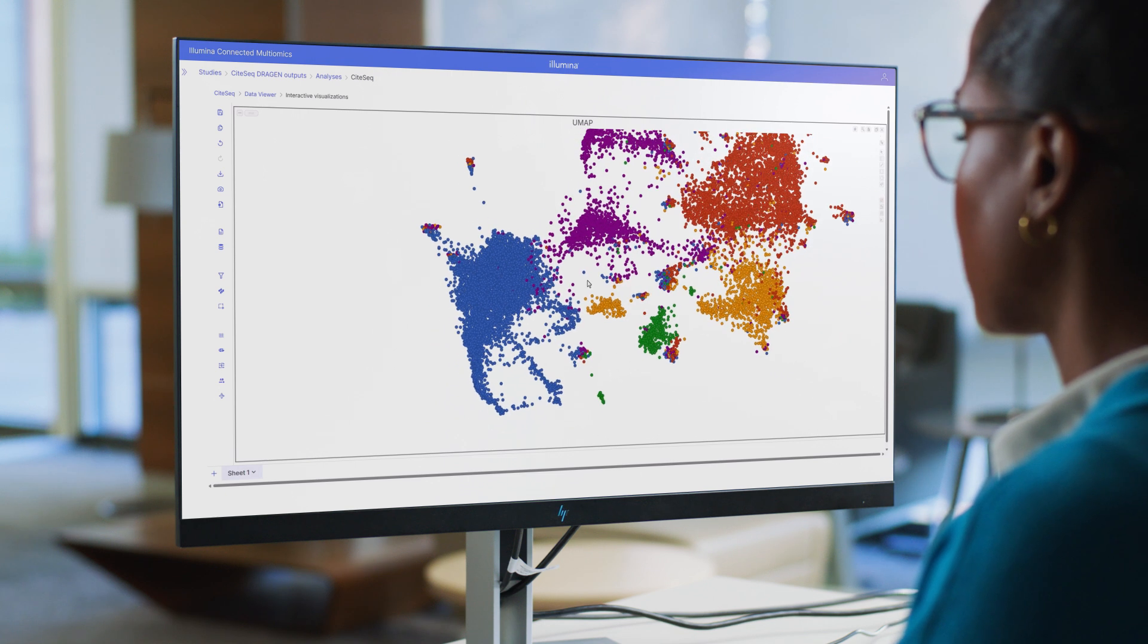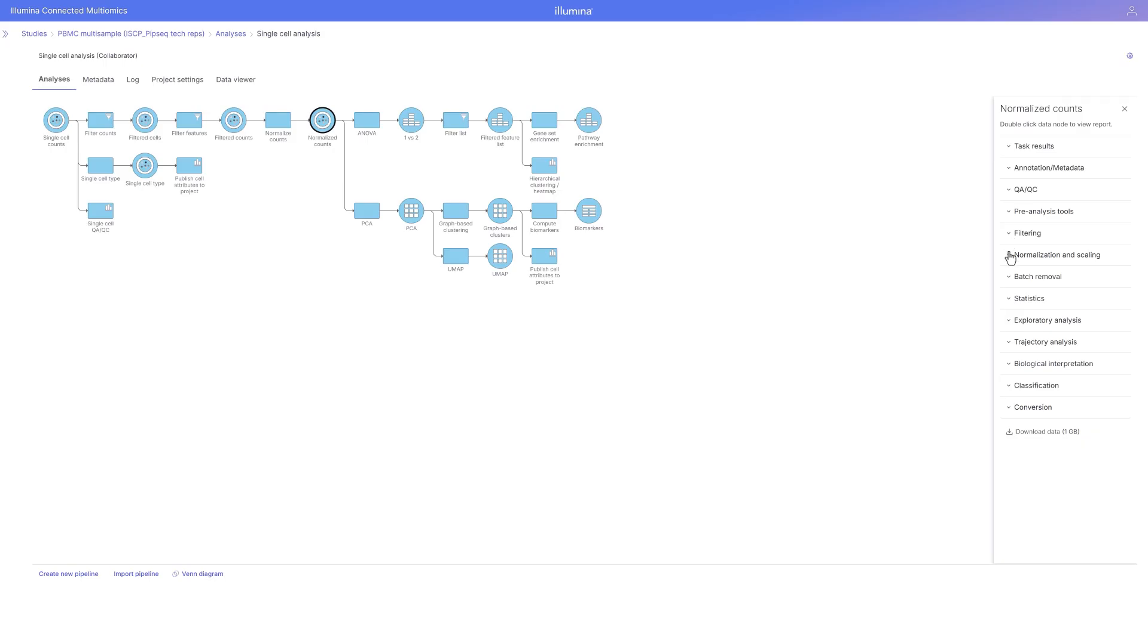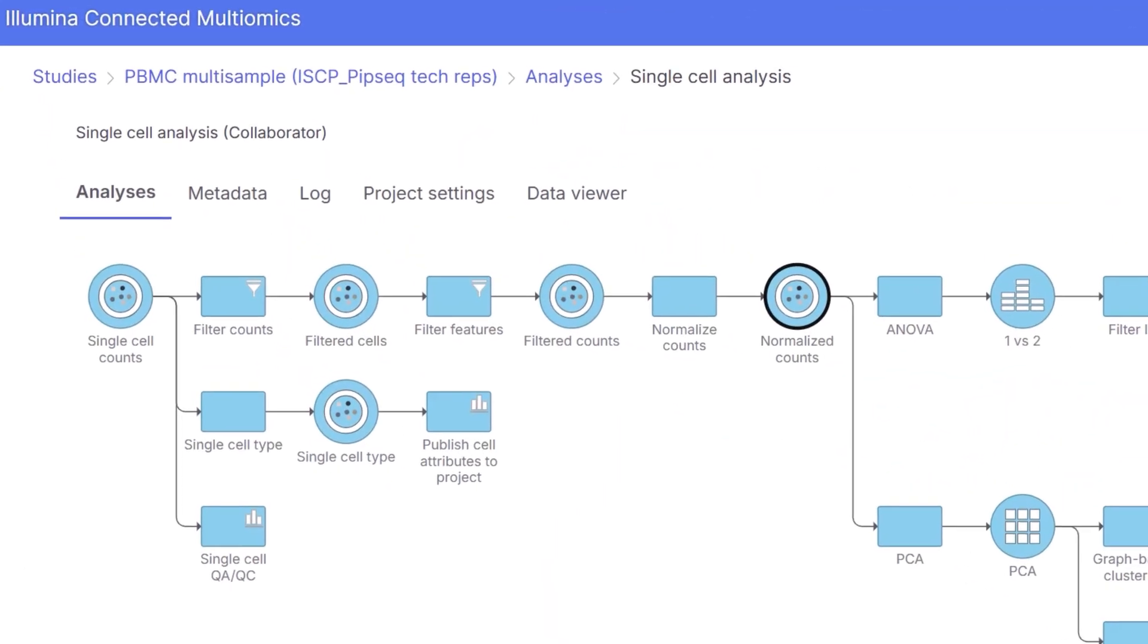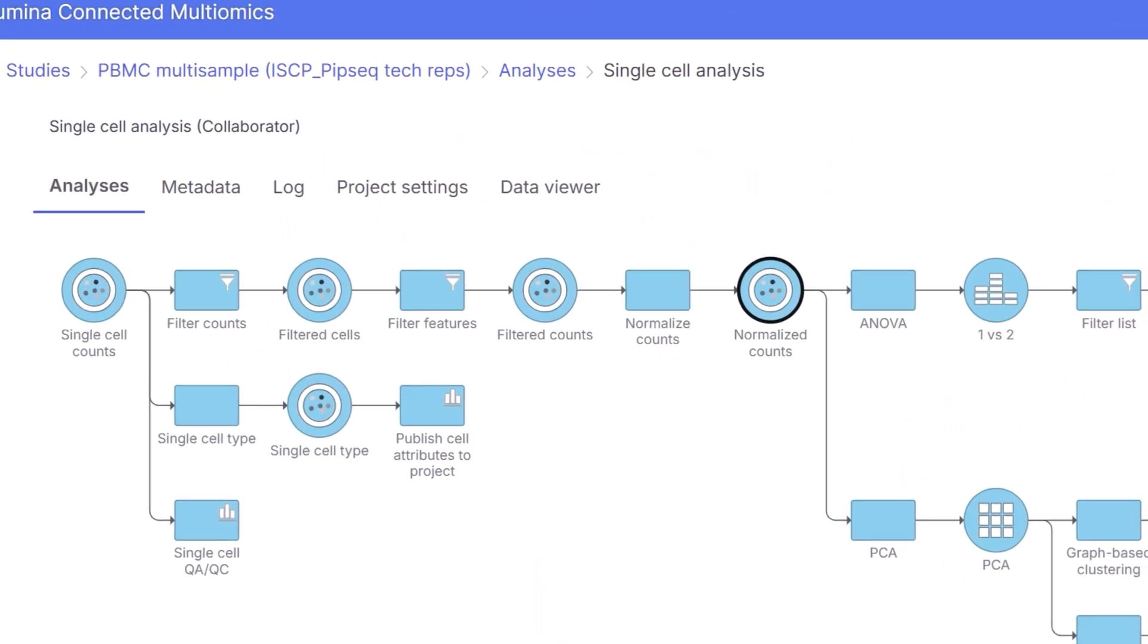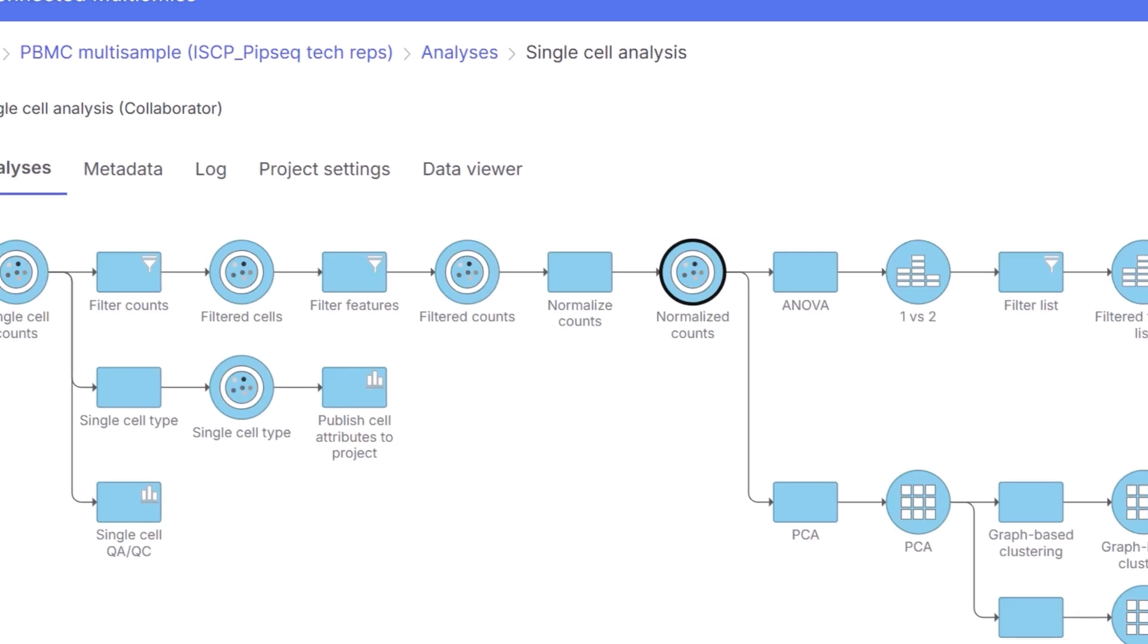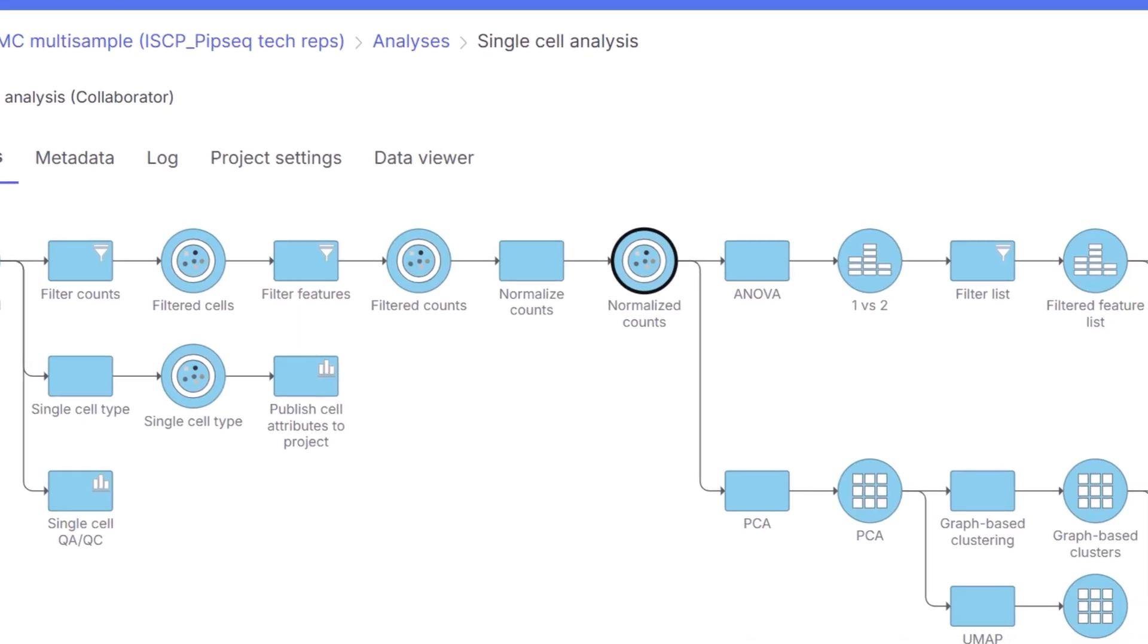I have the flexibility to analyze data with pre-configured pipelines or create custom pipelines that leverage industry standard statistical tools.